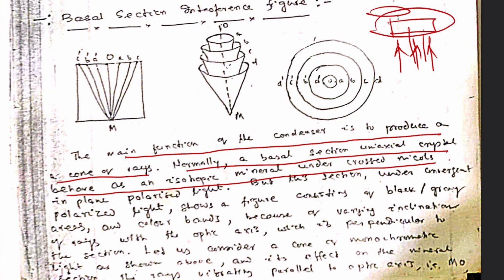These are the parallel light rays. So this is a case of orthoscopic arrangement, and if this is a basal section, light will simply pass through it without any deviation, because in the basal section the atomic structure is uniform. So this light simply passes through and is caught up in the analyzer, because the analyzer vibration direction and polarizer vibration direction are mutually perpendicular.